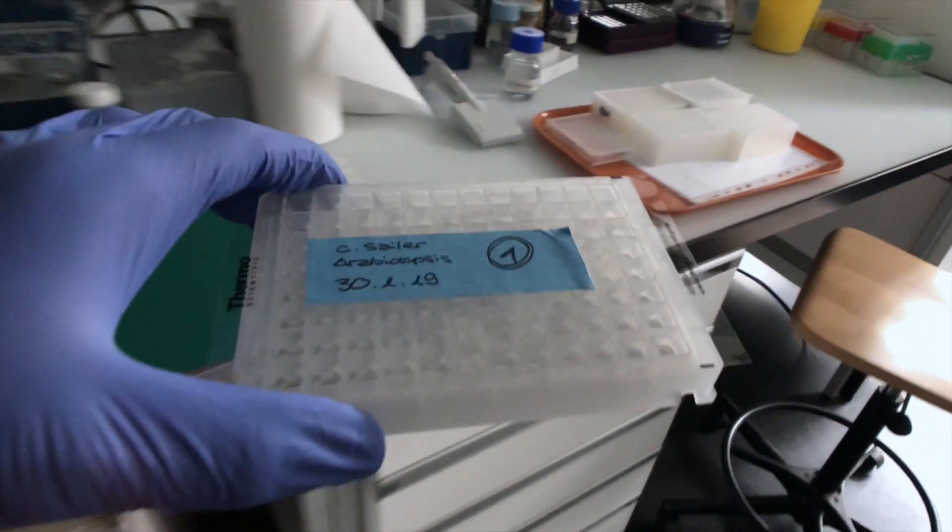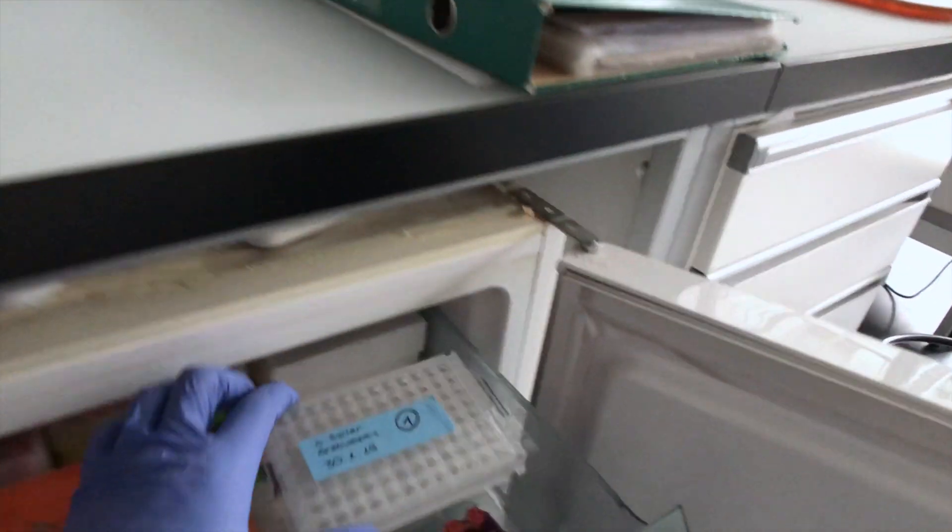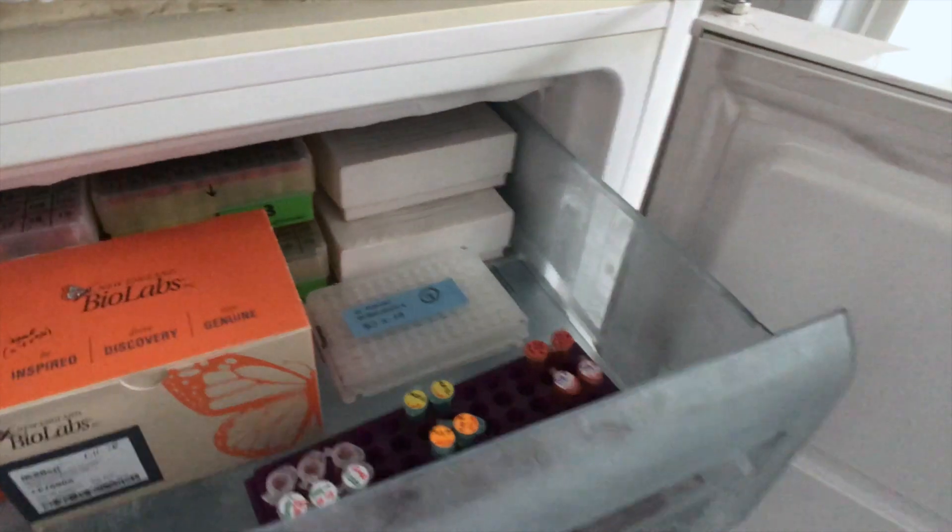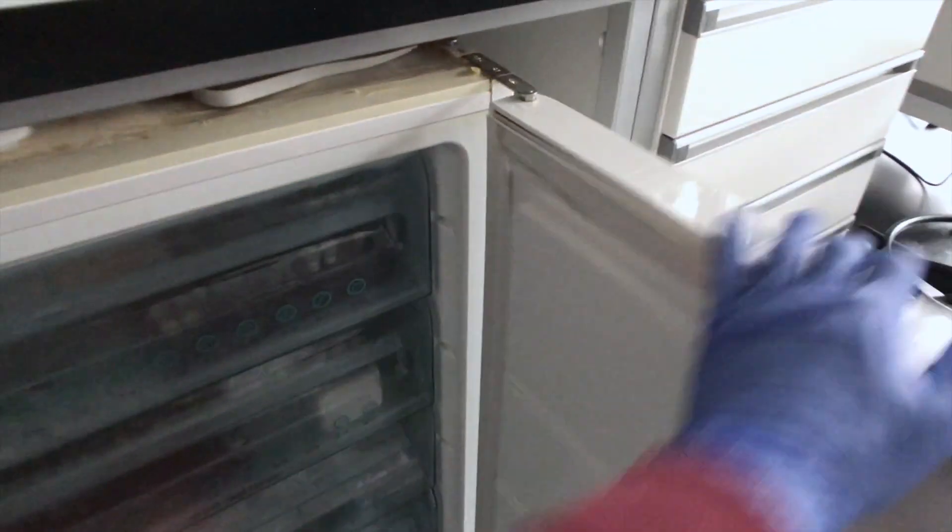The DNA that we extracted is dissolved in a liquid in these plates. To store it we freeze it at minus 20 degrees Celsius. Now we have the DNA of each plant.